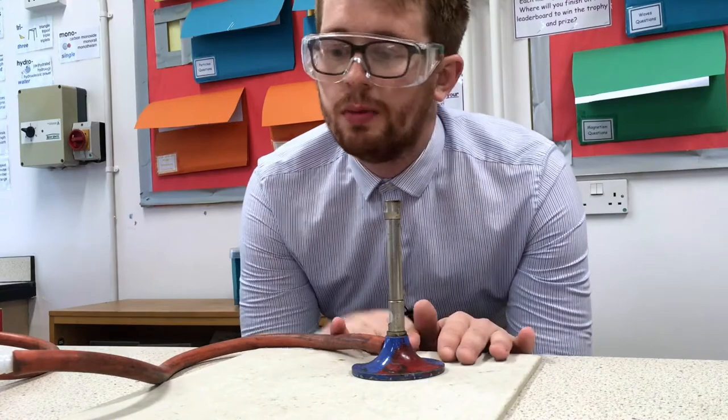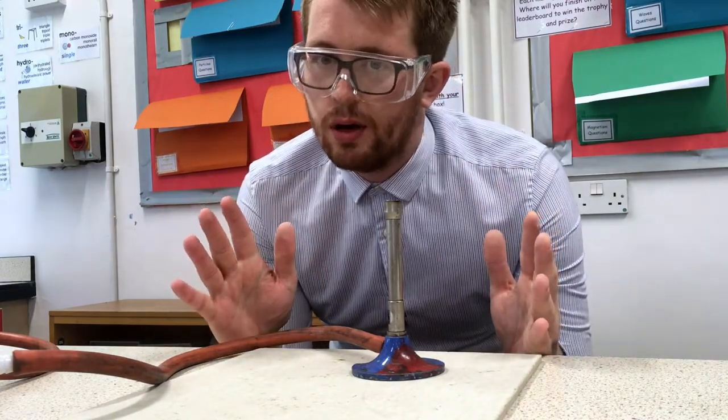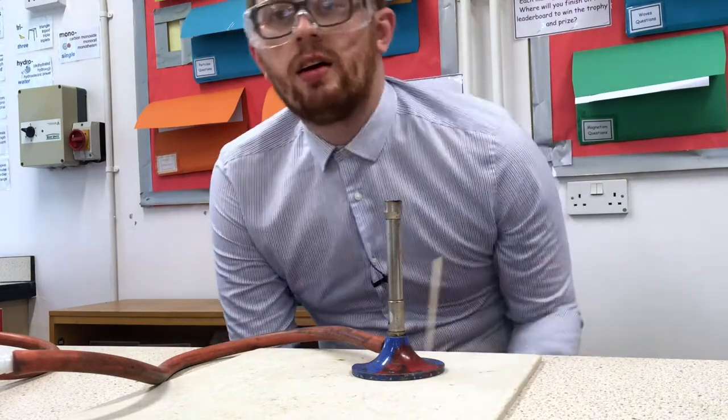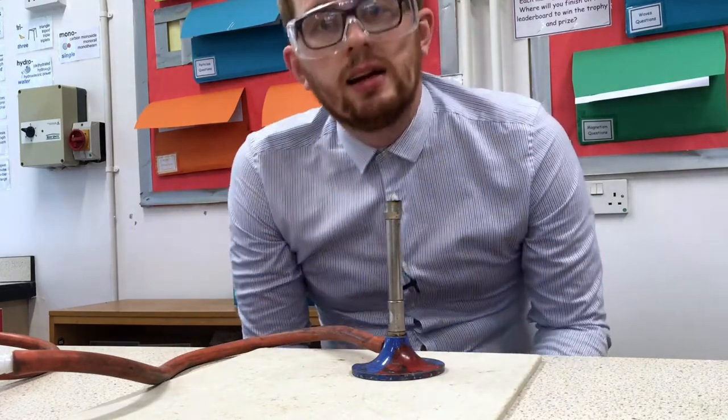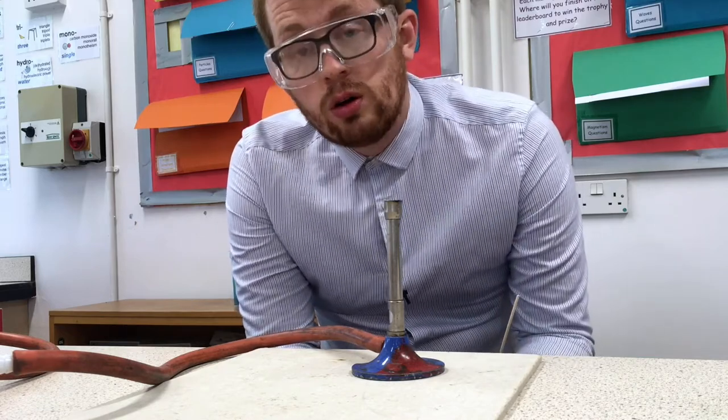So now you have your Bunsen burner, your heatproof mat, your hair's tied up, goggles are on, tie is in — you're ready to light the Bunsen burner. First, just check that the air hole is closed. Secondly, make sure that the flame is over the Bunsen burner before you turn on the gas.